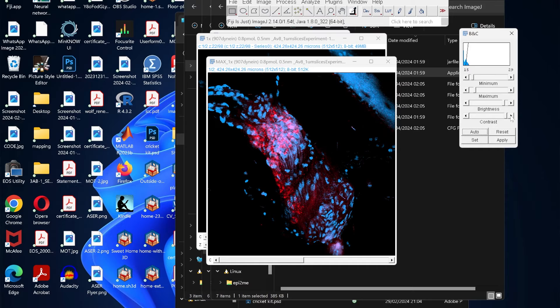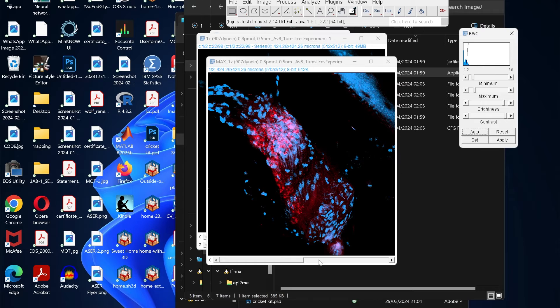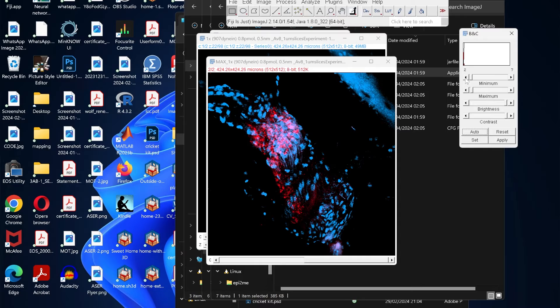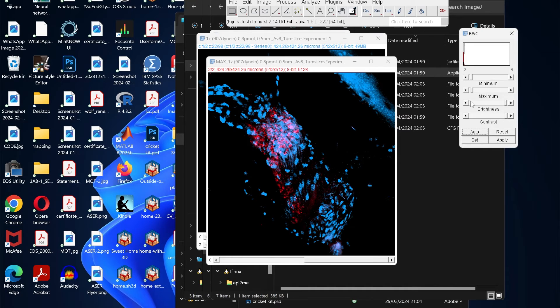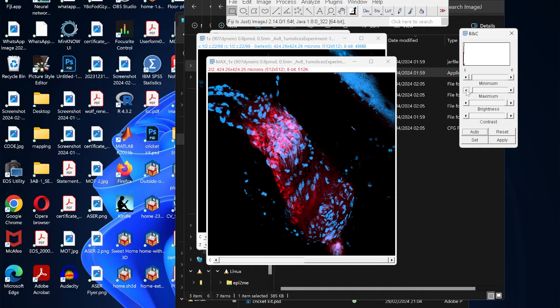You can also increase the brightness or the contrast. Similarly, you can go to the other channel and change this as well. We have this red channel, so we can increase or decrease the brightness, something like that.